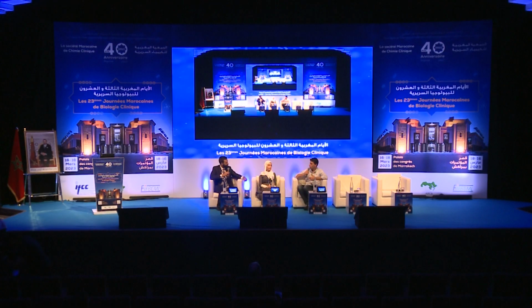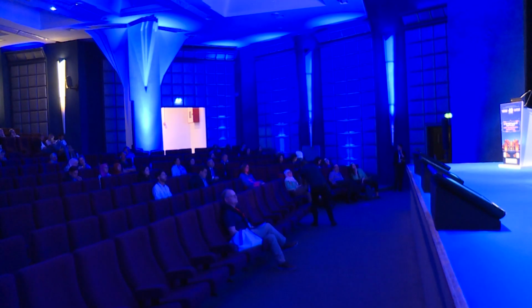I have lab experience too, a lab background, so I would say that sometimes we have to recentrifuge the specimen because of lipemia or any other special requirements. That's why, if such a process is required, I would recommend to aliquot the sample into a secondary tube and to centrifuge a second time. In this case, we would avoid any complications related to gel performance. Generally, we do that for some special cases, even when we have some limit values for some tests, such as HCV serology, when you have very limit values, and when you centrifuge a second time, generally you solve your problem. So in practice, we still do that, but I think that your reflection is interesting, to aliquot before centrifuging another time.